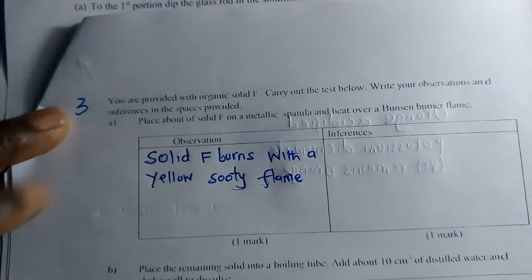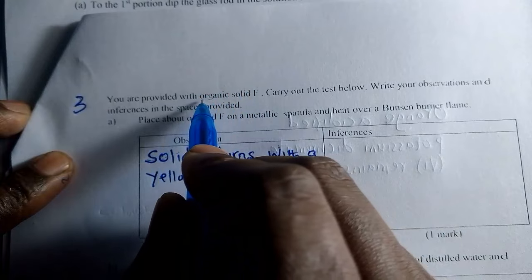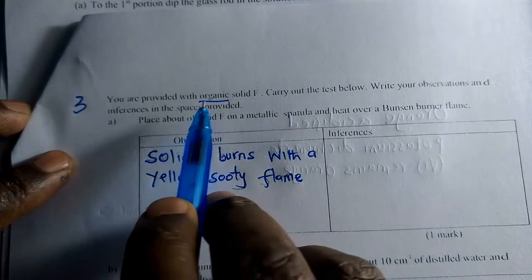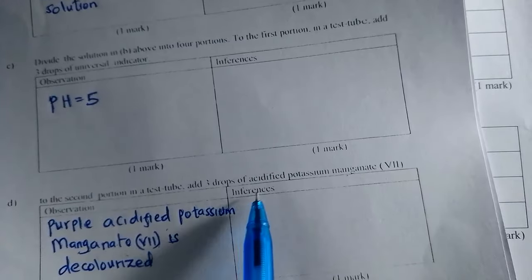Though that is very important. Look at question 3. Question 3 is an organic solid, right? Even when you are not told, you come here and check on the reagents that are being used. Here we are using universal indicator. We are adding acidified potassium manganate.